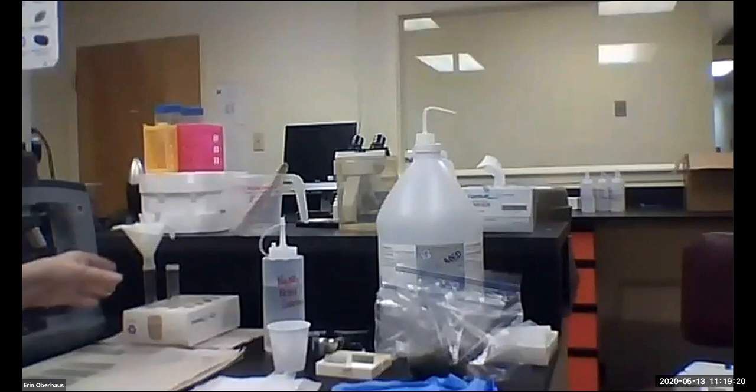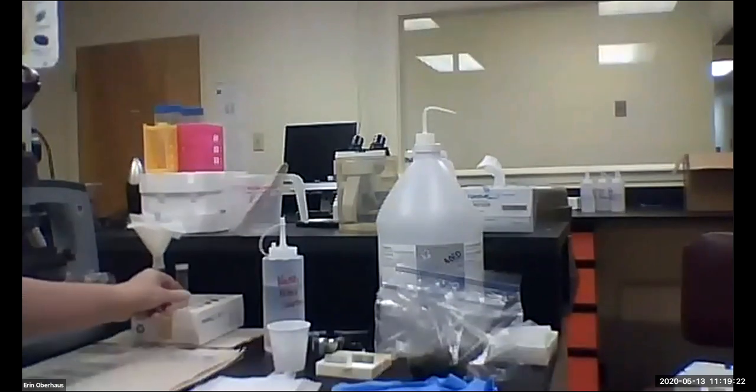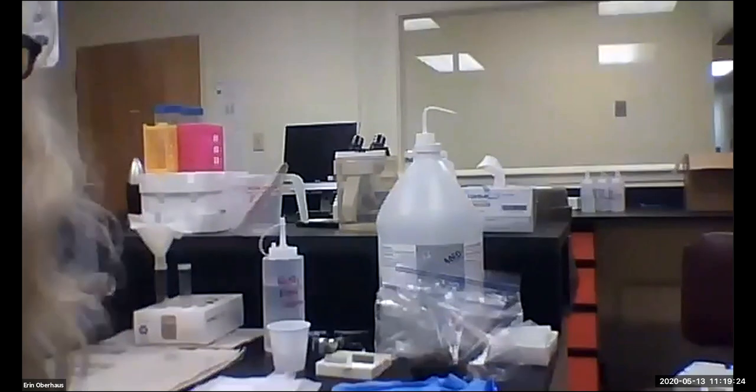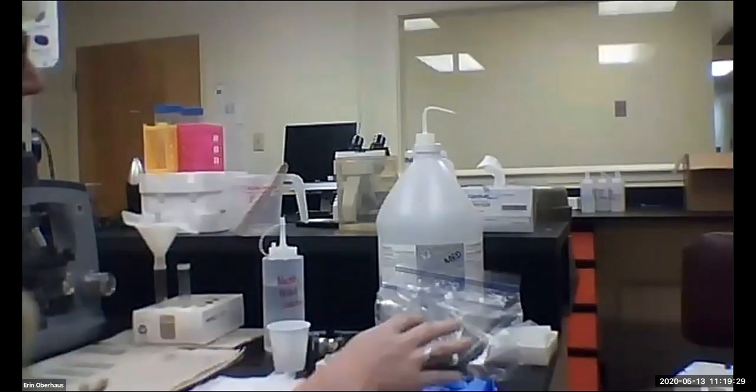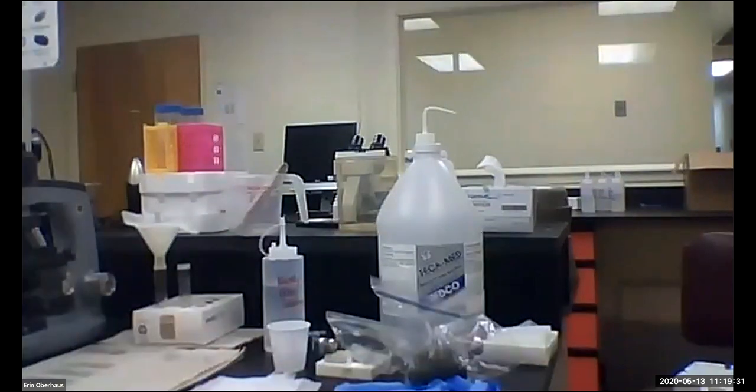So you'll need a container to strain your solution into, and some sort of funnel. If you don't have a funnel, you can also use a tea strainer.